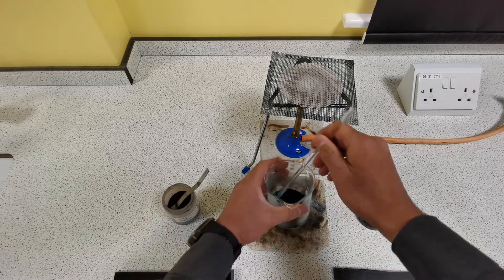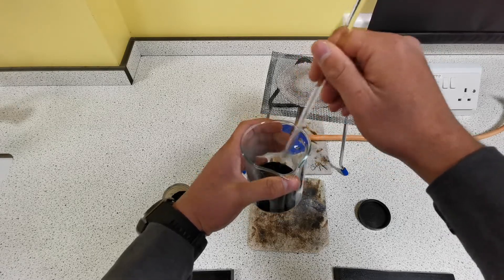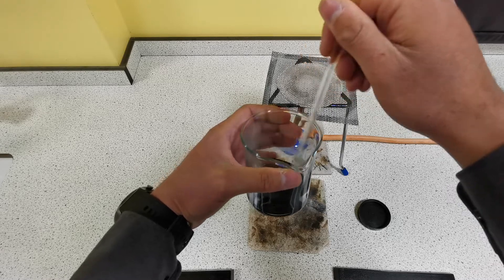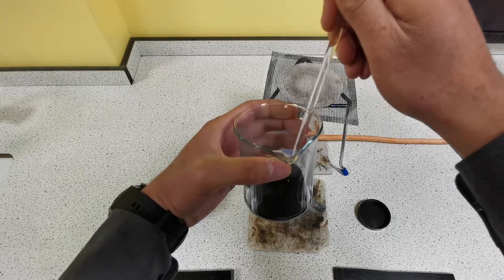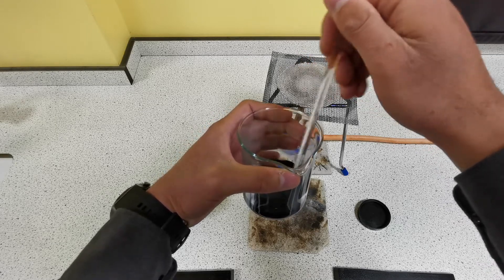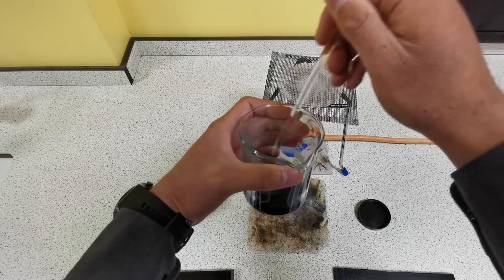Keep stirring, and keep adding spatulas of copper oxide until the copper oxide is in excess — meaning there's more than enough. You'll know when the copper oxide has been added in excess because there will be black copper oxide powder remaining in the bottom of the beaker. We want to add copper oxide in excess to ensure that all of the sulfuric acid has reacted, so we get pure crystals of copper sulfate at the end.